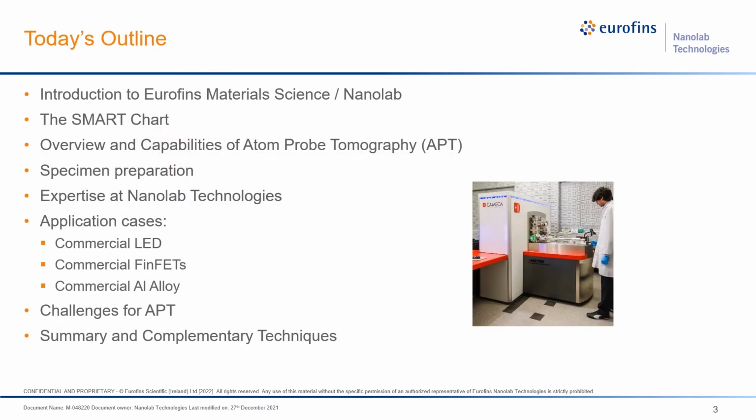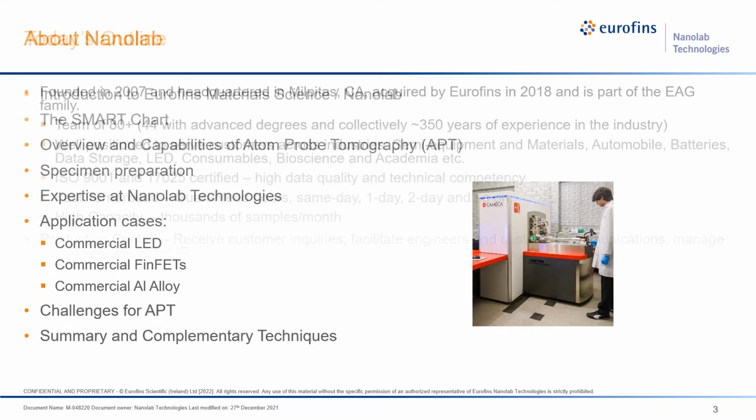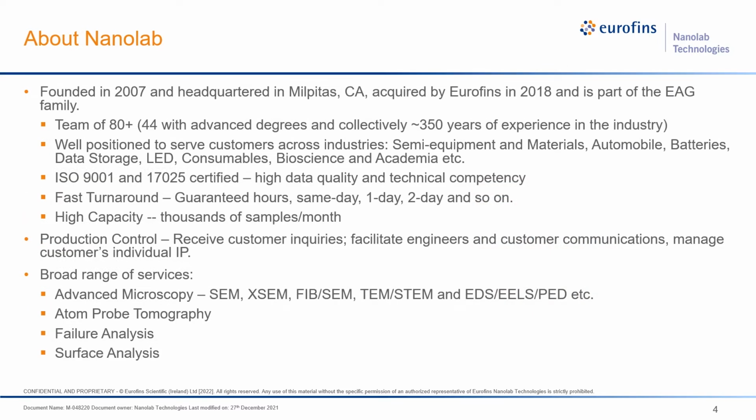The outline of today's webinar will start with an introduction to Nanolab Technologies and the Material Science Division at Eurofins, followed by the SMART chart, an overview of APT or atom probe tomography, specimen preparation, specific expertise for APT at Nanolab Technologies, application cases which were investigated in-house to demonstrate APT use, followed by the challenges and the concluding remarks.